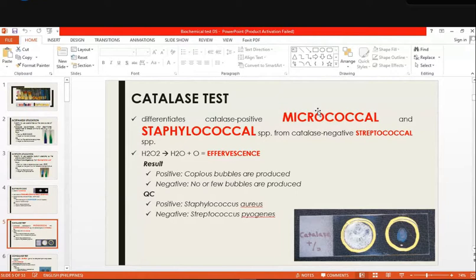Okay. Yes. So, sheep blood. Tinatalagay natin ay blood. So, pwede siyang sheep blood. Kung meron, dapat sheep blood talaga. Pero kung walang sheep blood, pwede namang human blood, defibrinated human blood. Okay? So that, ano ang meron si blood na magiging parang catalase din siya?